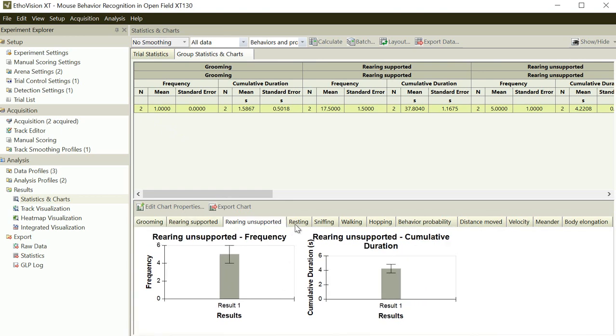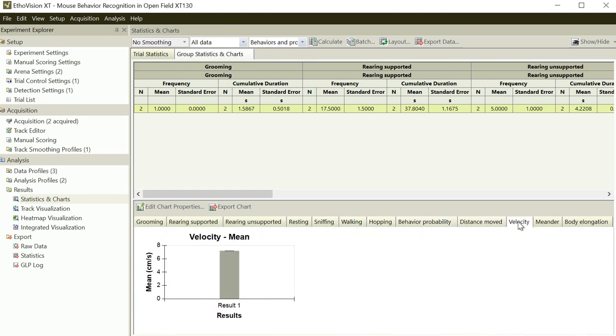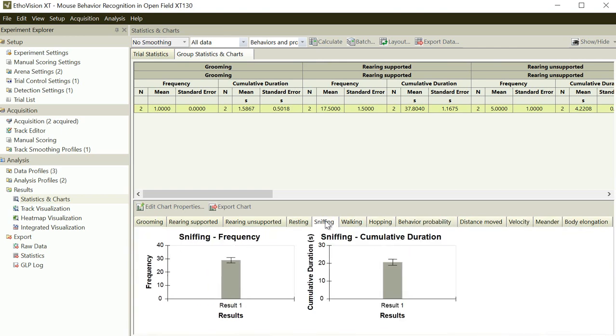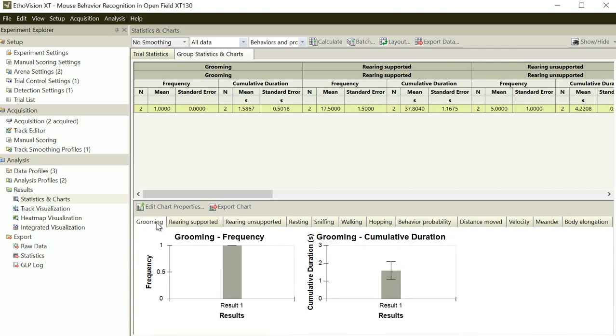And each parameter has this kind of summarized final outcome. So here, maybe your question is why this is only one data. So we have control and treatment, two kinds of animals, and we want to compare them.